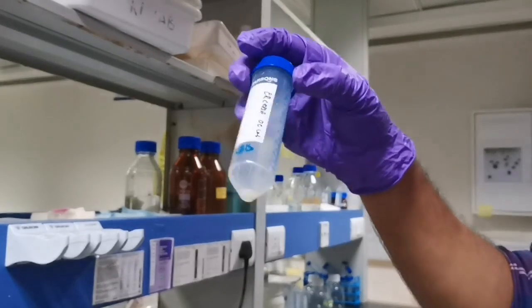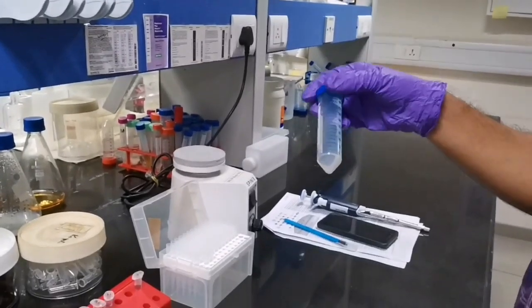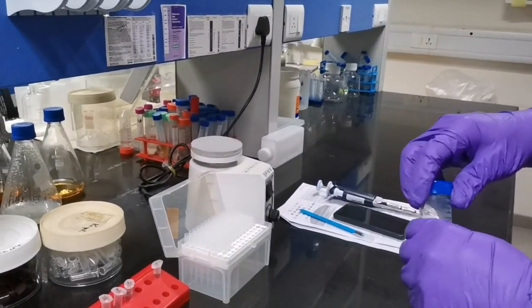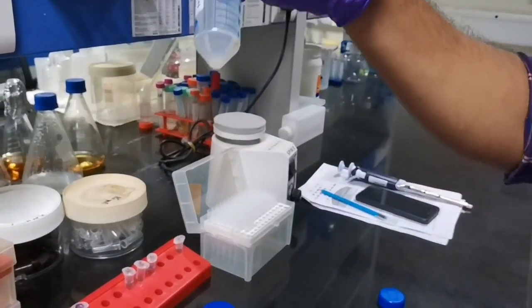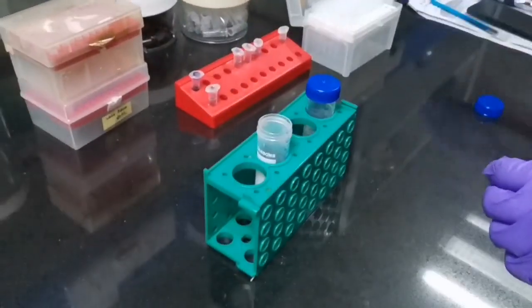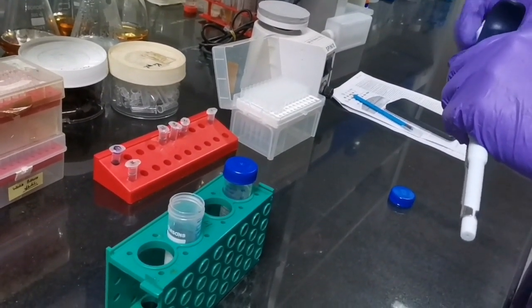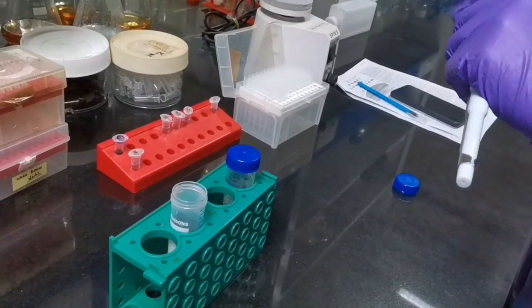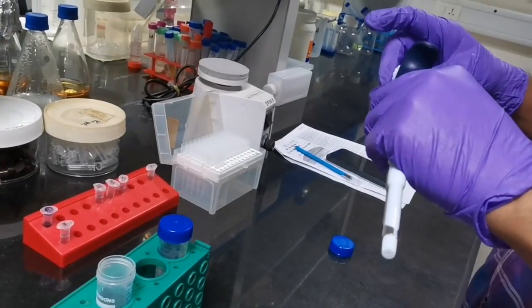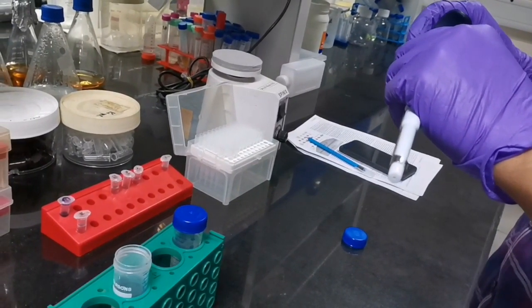The pellet of overnight grown culture from which we are isolating plasmid by manual prep. For that, this is 7.5 ml culture, so we are adding solution 1, solution 2 and 3 accordingly. I am going to add 300 microliter solution 1.